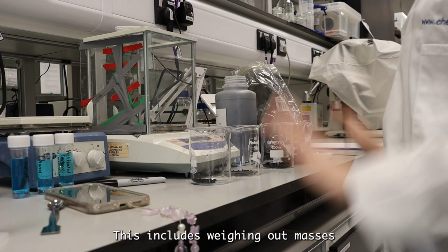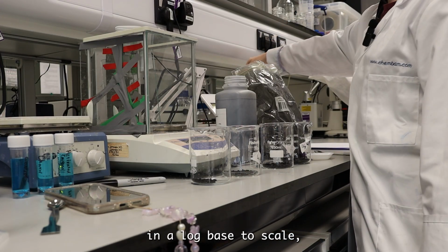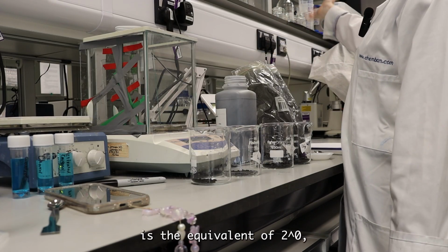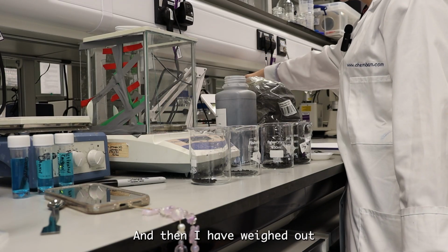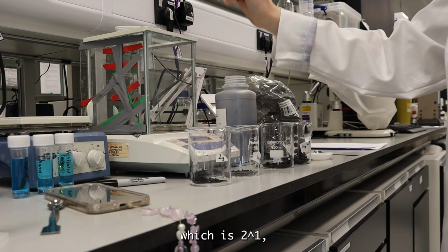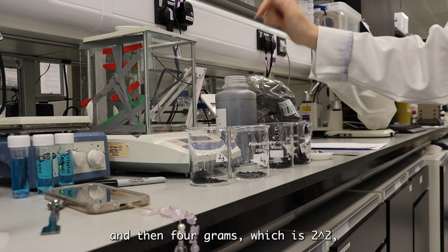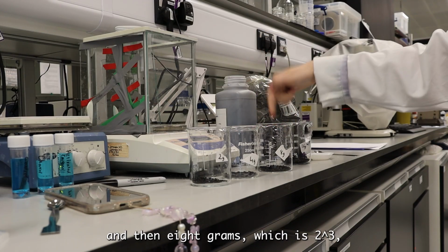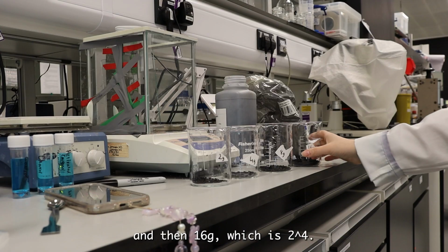This includes weighing out masses of the activated carbon in a log base 2 scale. So the 1 gram that is currently stirring is the equivalent of 2 to the power of 0, because anything to the power of 0 is 1. And then I have weighed out 2 grams of activated carbon here, which is 2 to the power of 1, and then 4 grams, which is 2 to the power of 2, and then 8 grams, which is 2 to the power of 3, and then 16 grams, which is 2 to the power of 4.